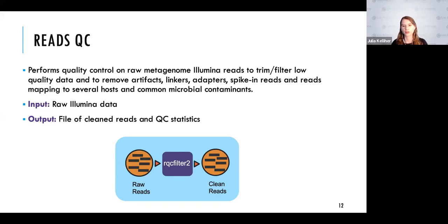So they can answer any questions about the specific tools that these are using, any of the parameters that are being chosen, anything like that. We have all of that specific information also in the extensive documentation. For the READS QC, I'll give you just a little bit of a brief introduction to each workflow, and then you can ask more in-depth questions, or we can talk more in depth later.